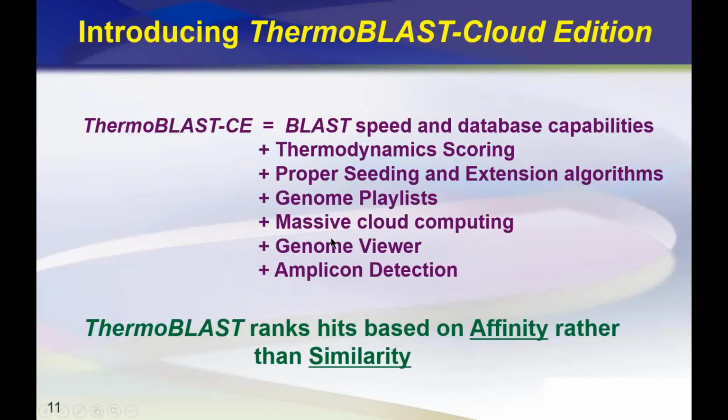All right, so now let's talk a little bit about the ThermoBLAST Cloud Edition. We just released this for full public release. We did a 2-month beta testing period with some of our longtime customers who gave us a lot of good feedback, and we've responded to that. But ThermoBLAST Cloud Edition combines the speed and database capabilities of BLAST with a lot of extra goodies. So one is that it includes thermodynamics-based scoring instead of similarity-based scoring.